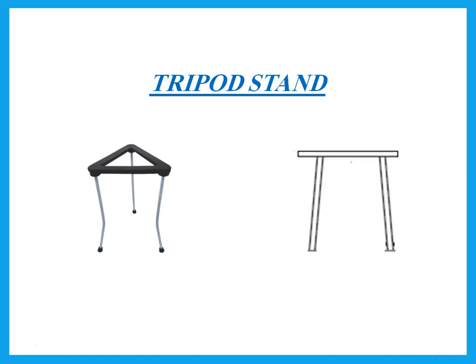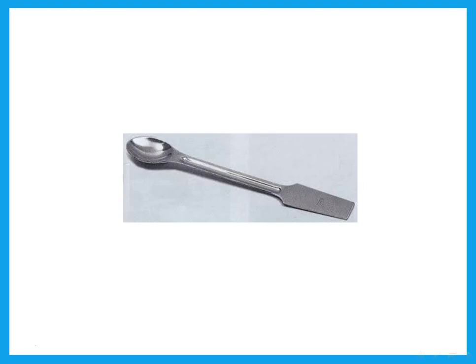Okay, this is called what? This is a tripod stand. Sometimes they say just tripod, but actually it should be tripod stand. This is what we put our flask on when we're heating.